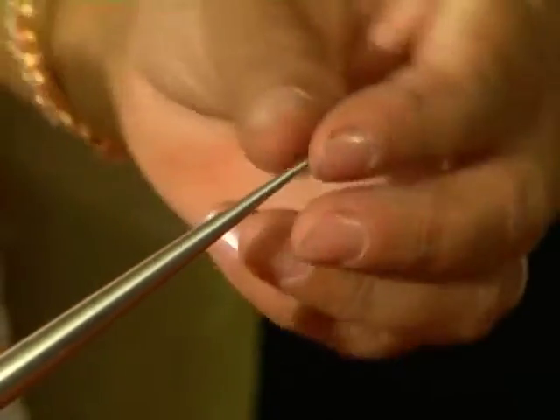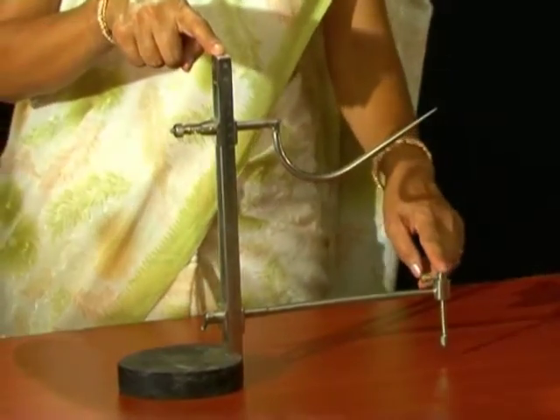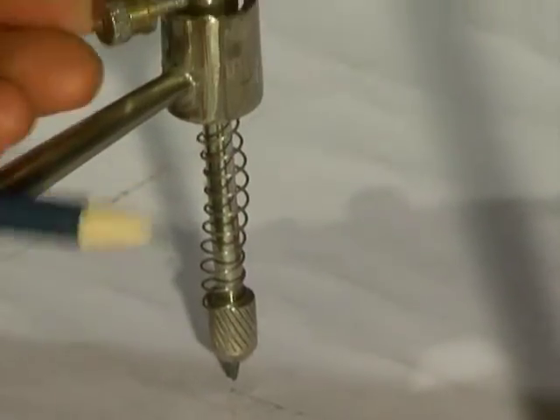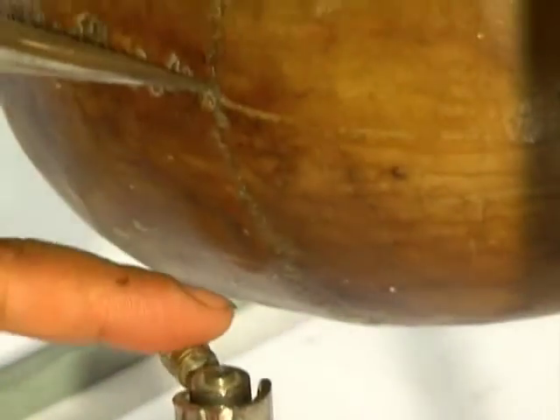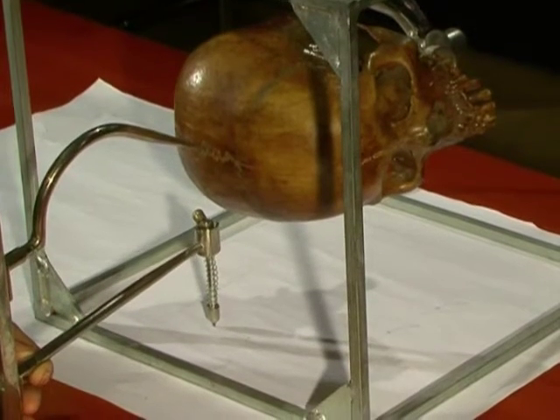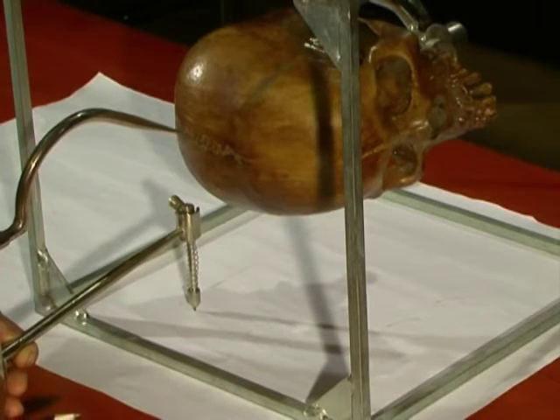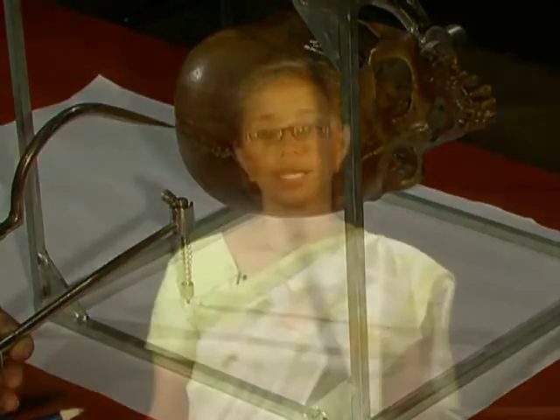Precaution. The instrument has to be first checked for any instrumental error. That is, the pointed tip of the diagraph should be in the same vertical line. While drawing the contours of the skull, care has to be taken that the upper pointed tip should not exert any pressure on the skull, lest it not only leave any unwanted impression on the skull, but also distort the sectional drawing as well.